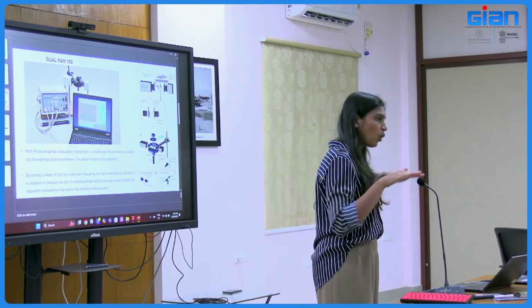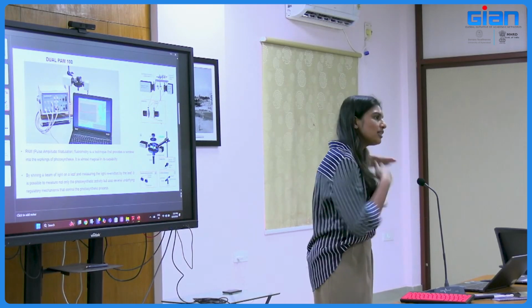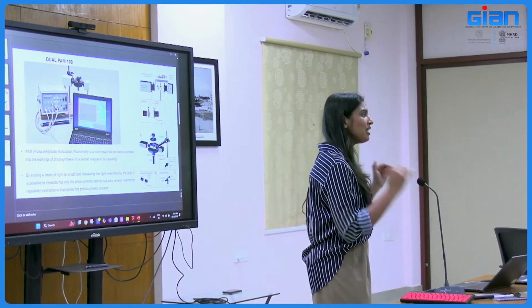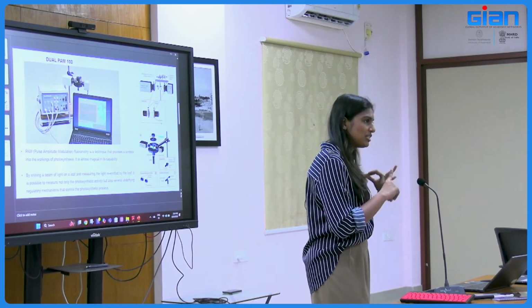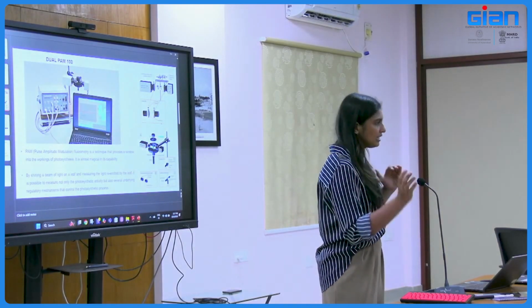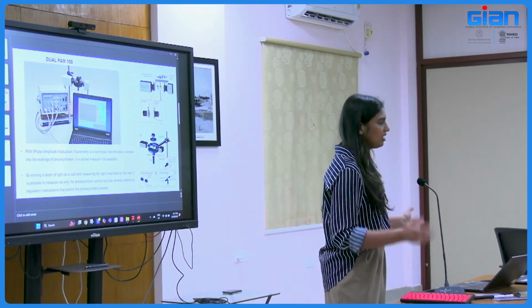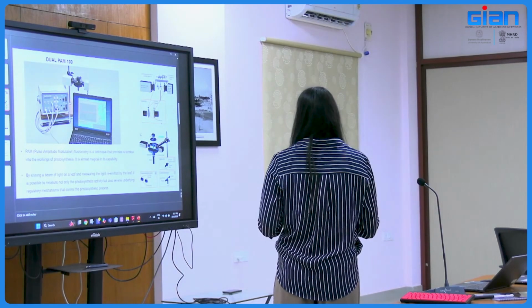So this will be the probe, or you can say for every experiment we will have a baseline. So this will work as a baseline for the system itself. It will function as a reference, you can say. This is called measuring light. That's how PAM detects the signal coming from the plants or whatever system we are working with. That's why it is called pulse amplitude modulation fluorometry.